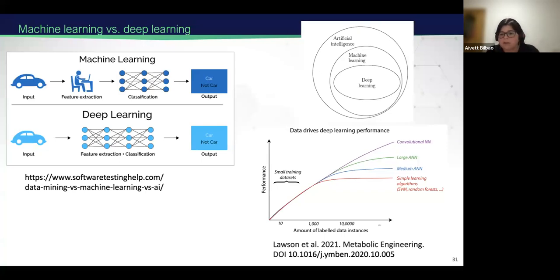But deep learning really has the power to learn from the raw data and has more power to model complexity. And you don't need to specify these features up front. The model will extract those features. So you just need to provide the input from the raw data and the output that you expect. And of course, you need many more training instances to make the model able to properly learn and generalize. But that's the advantage. You don't have to design those features by yourself.